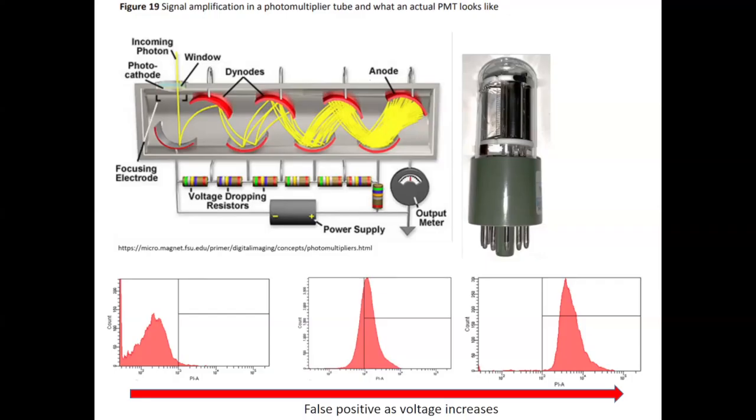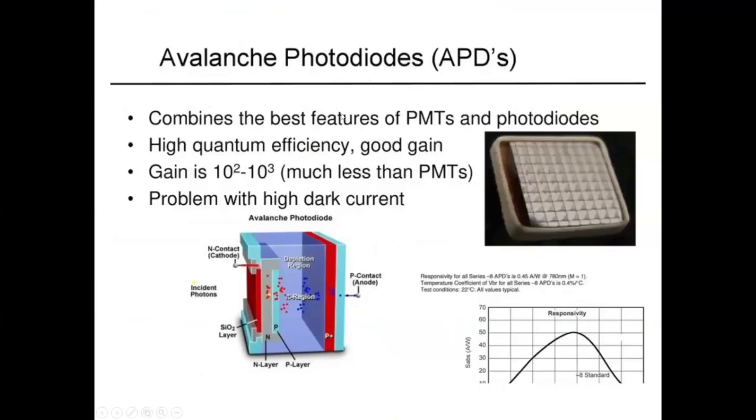So that is the thing with the photomultiplier tube. You should keep a check on the voltage of a photomultiplier tube. And recently, especially Beckman have come with another detector, which is as stable as a photodiode, but can also multiply the photons. So it is a combination of both the conventional photodiode and a photomultiplier tube, and that's called avalanche photodiodes, APDs.